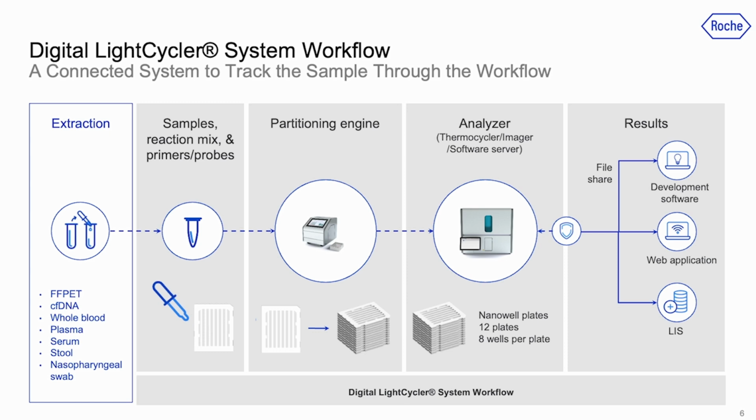And after the run is complete, the results are validated and then sent back to the LIS. Okay? So when that has been accomplished, there is an opportunity to go through and use either the development software, which would be more for research-based focuses, or analysis packages that are already predetermined, to allow for results to come out from your run itself.